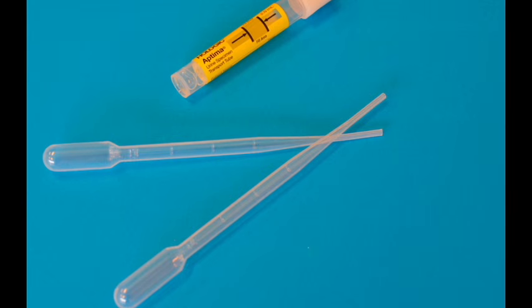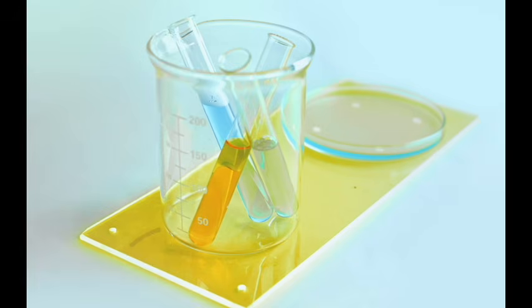You should have separate pipettes for the separate test tubes. These solutions must not mix. If you mix them, then it becomes a problem for you. So each pipette is for each test tube differently, and then you have another pipette for the iodine solution. So you have 3 or 4 different pipettes there. This idea is continuous in chemistry: solutions must not mix unnecessarily.